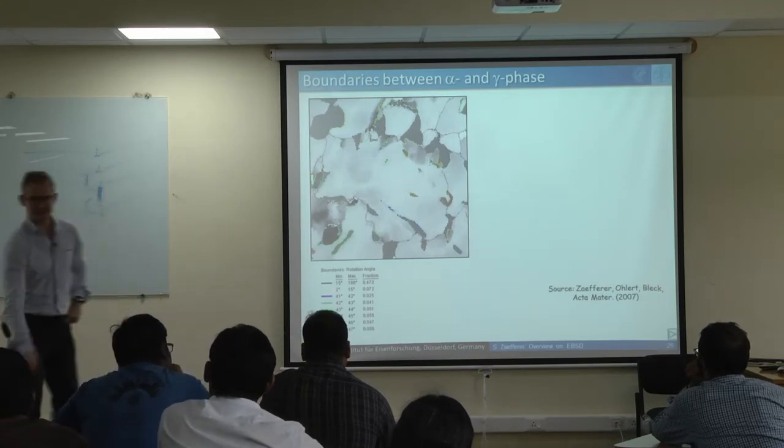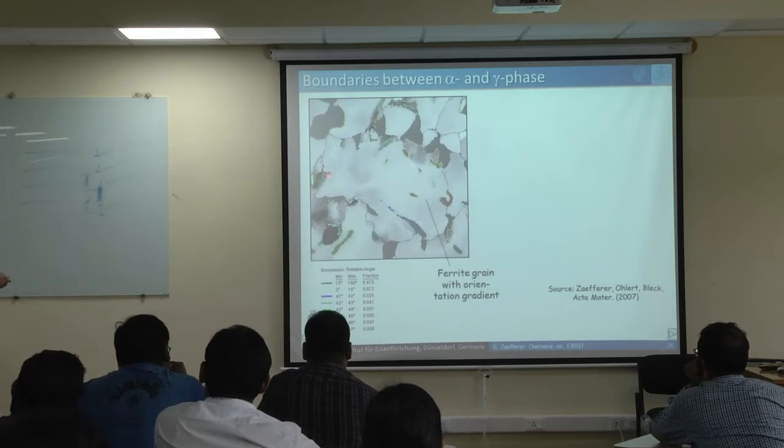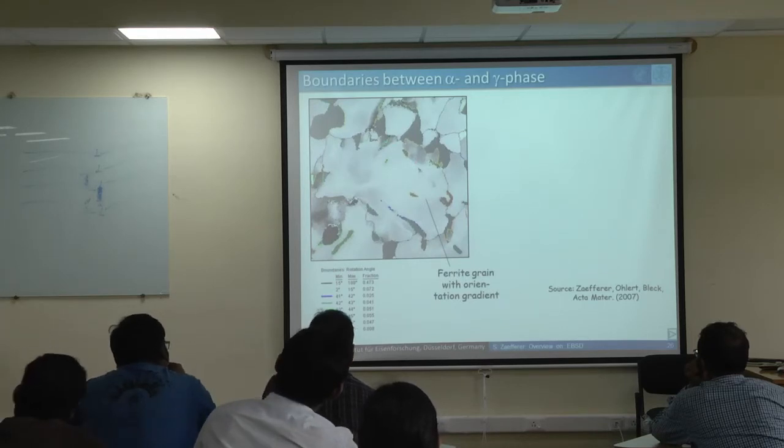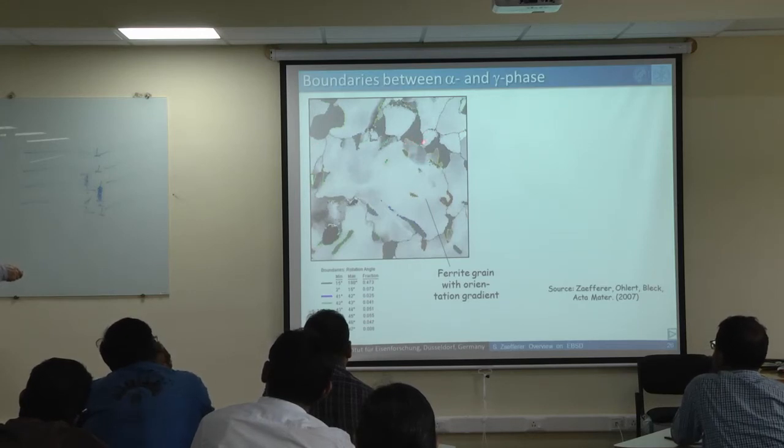Why 40 degree, yeah? And we will see that in a moment. And then there is further information inside of these grains here. I'm also plotting misorientation information. So I have plotted the misorientation across the boundaries here.